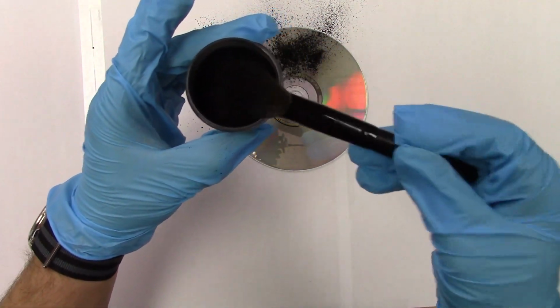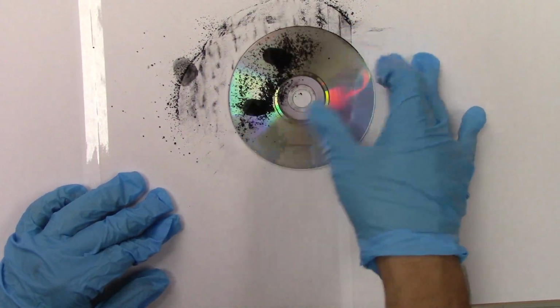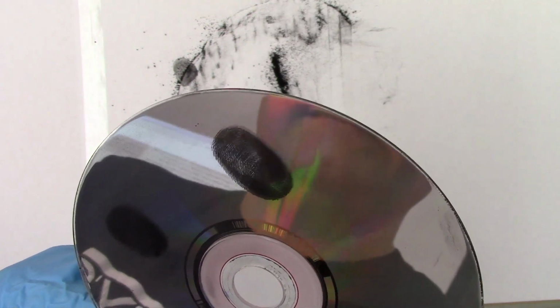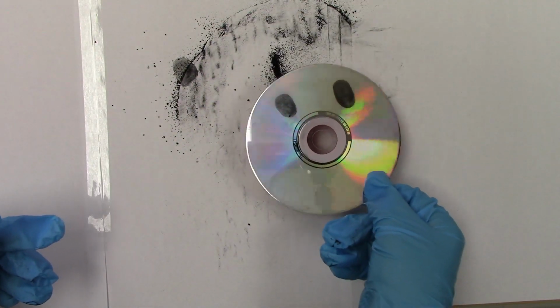And this does not clean up. So I'll put that there. All right, I'm just going to close this up. That's why I'm wearing gloves. Excellent. I'm going to get rid of that too, because it's going to make a mess. All right. So I've got this disc, and I've dusted on it. I can shake it around, move that dust all over the print, and then if I take this, look at that. A perfectly preserved fingerprint with all of the lines and details. It's just accentuated all of the oil and brought it into focus.